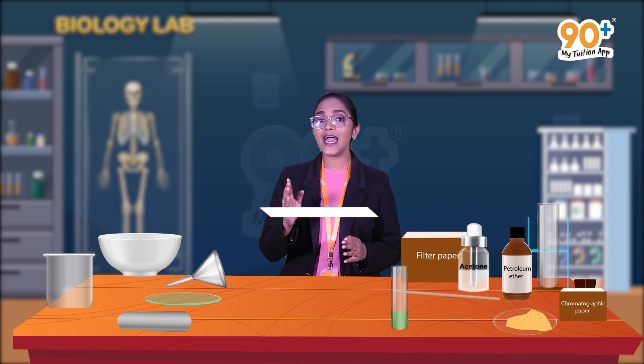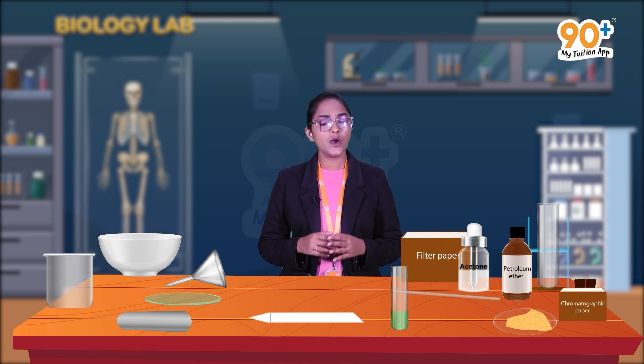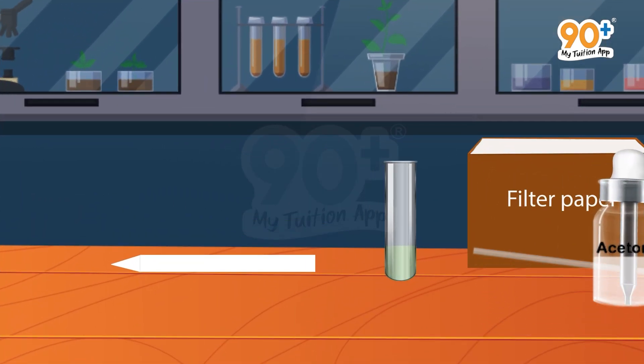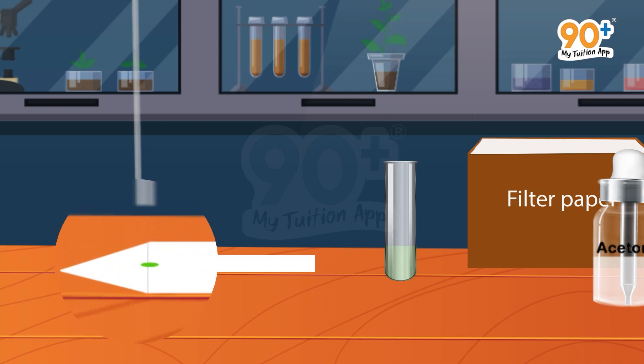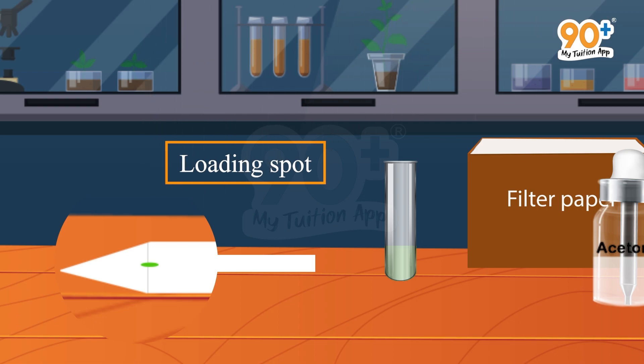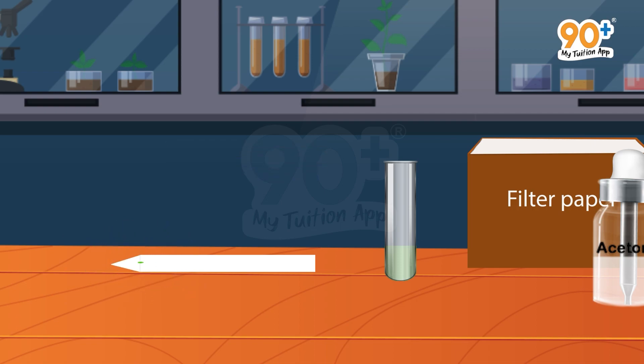Next, take a strip of chromatographic paper — one end of the paper should be cut and pointed. Now place the pigment extract over the notch or pointed end of the chromatographic paper with the help of a capillary tube. Place a drop of leaf extract over this pointed end, then allow the drop to dry. Similarly, place four or five drops over the same point. You can now see a spot over the chromatographic paper — this spot is known as the loading spot. The loading spot should be small and concentrated.